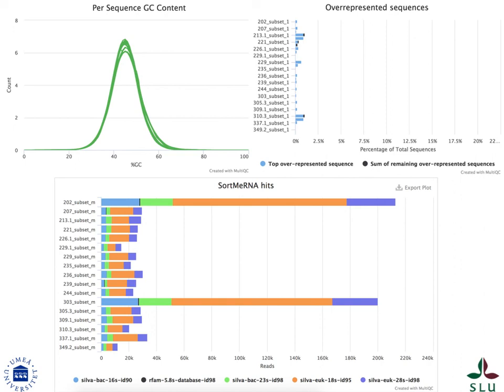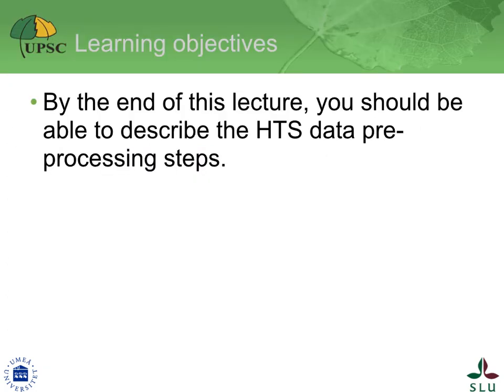In that example, it becomes obvious that two samples stick out as having a very high rRNA proportion of reads. We have now reached the end of the lecture. Thank you for your attention. You should now be able to describe the HTS data preprocessing steps.